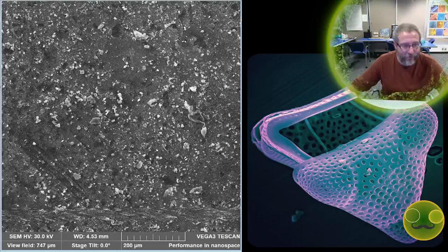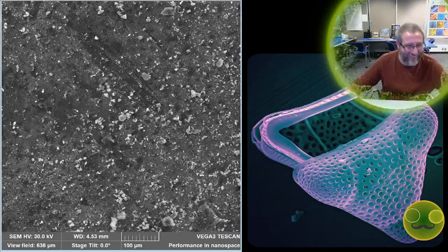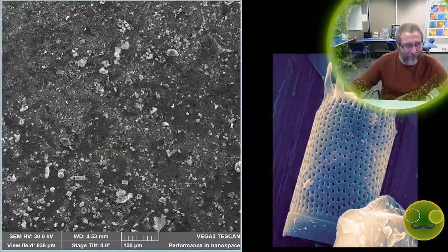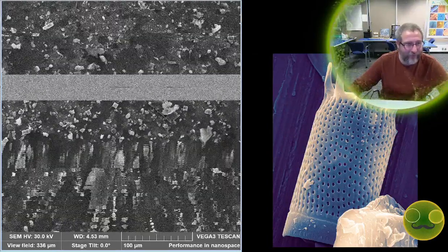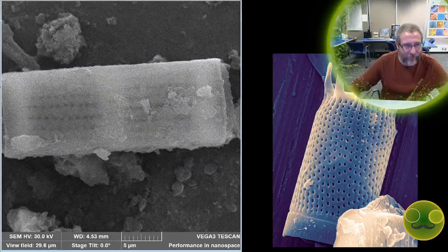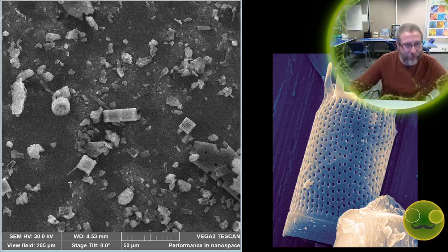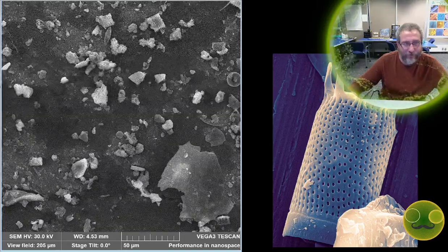So each half gets divided up among the children, the daughters in this case, and then the daughters end up holding hands with each other for eternity, as long as they stay together. And these diatoms, like this one, have these long spines that are the fingers holding the valves together, and they've been holding hands with their sister for 10 million years.